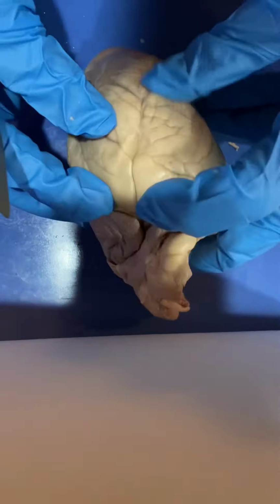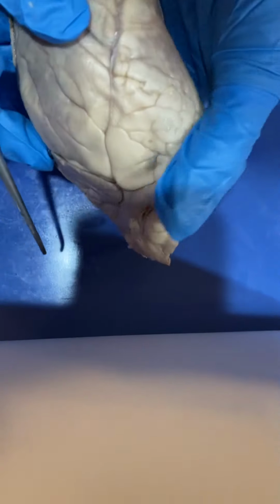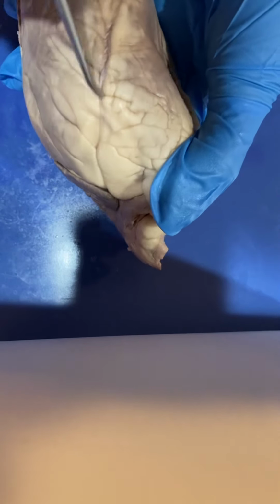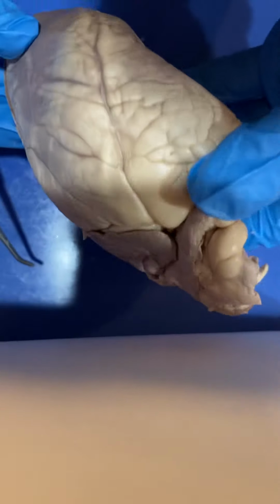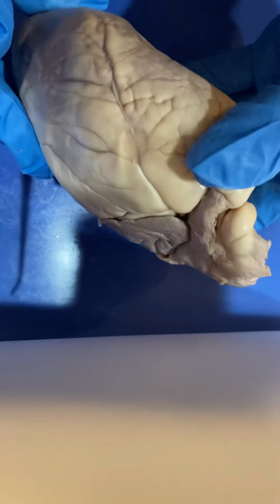So the first thing that you're going to notice are some external features of the sheep heart, and you're going to see the line that's going to be kind of running down the middle of the heart. You're going to notice it is sideways. That's because the heart is sideways in the body. It leans.